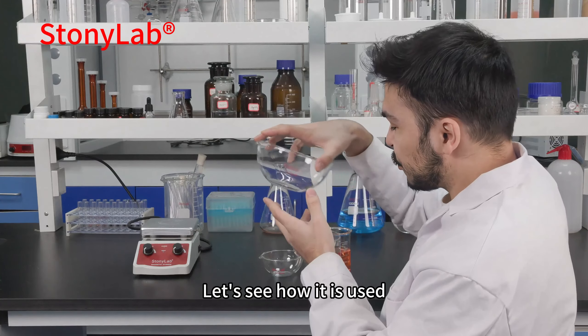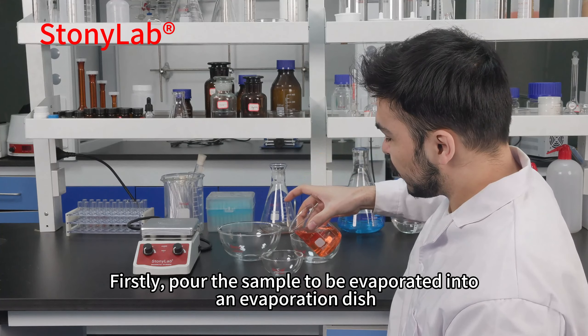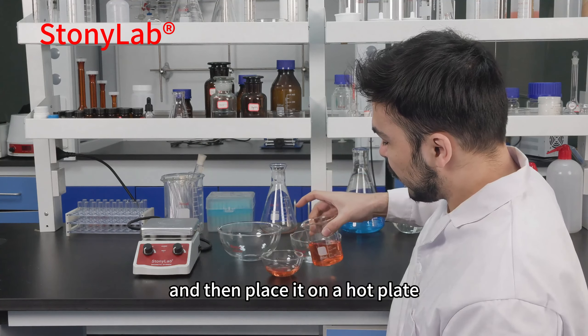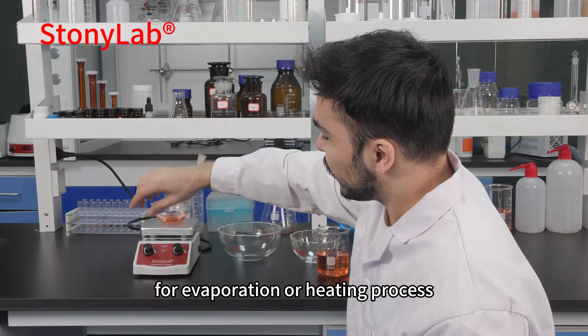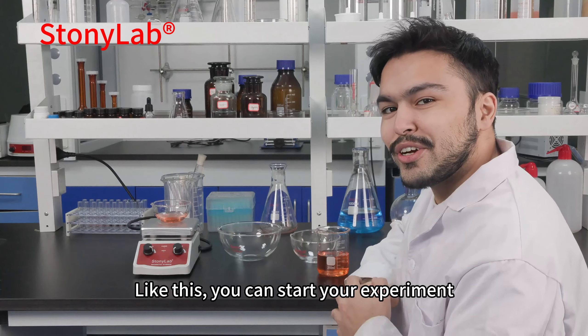Let's see how it's used. Firstly, pour the solution to evaporate into the evaporation dish and then place it on the hot plate for the evaporating heat process. Like this, you can start your experiment.